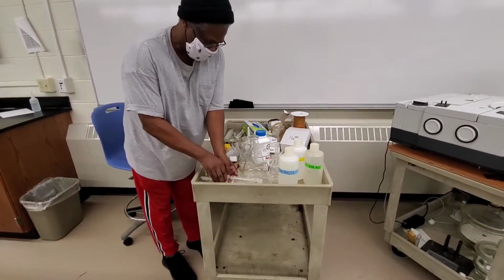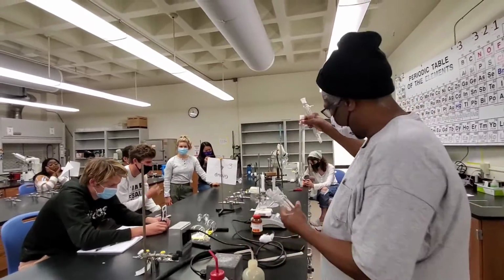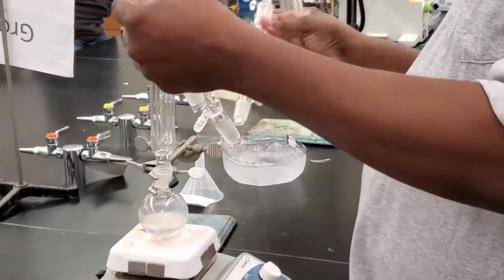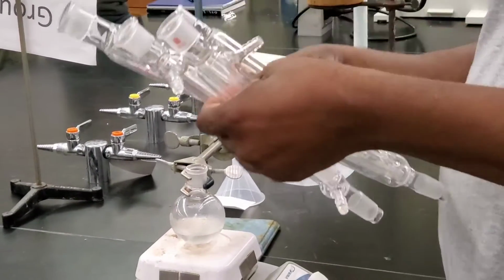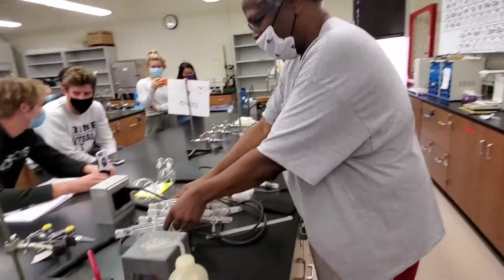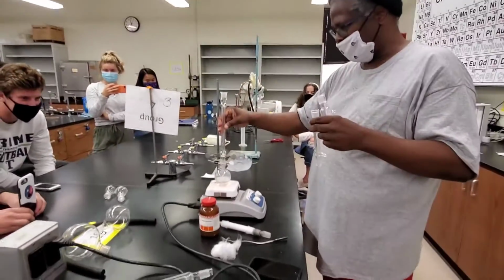You need to use a condenser. And we have different sizes again of condensers. Let me show you, they all are made so that no matter what size, they all fit in here, from the big one here to the smallest one, they all fit, okay? So normally if you do a reaction, you don't want to use this big one. We mostly use these sizes like this and this one.